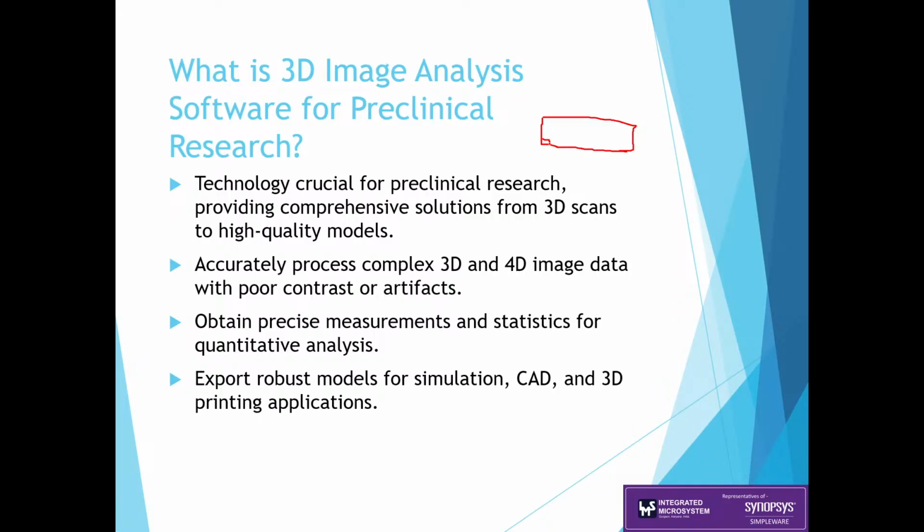So one pixel here, then one pixel here, then one pixel here. Sorry for the drawing, but it's just freehand. This particular image may be considered as made of many pixels. But when we are dealing with a voxel count, we also have a 3D visual representation, like what we used to study in our school times: the difference between a regular rectangle and a cuboid.